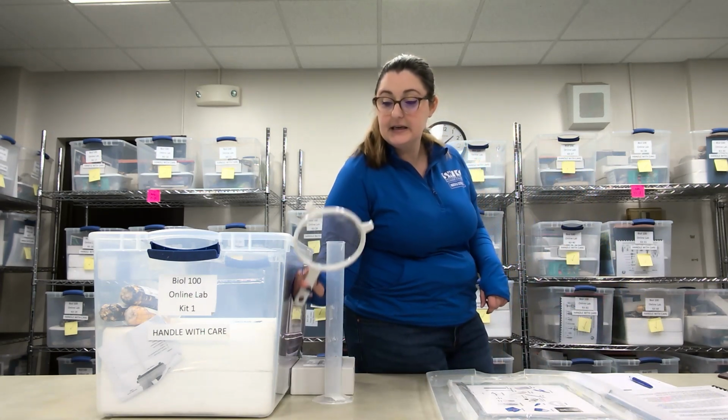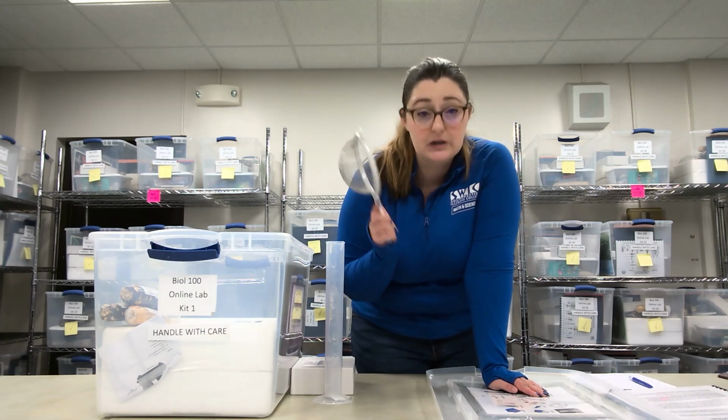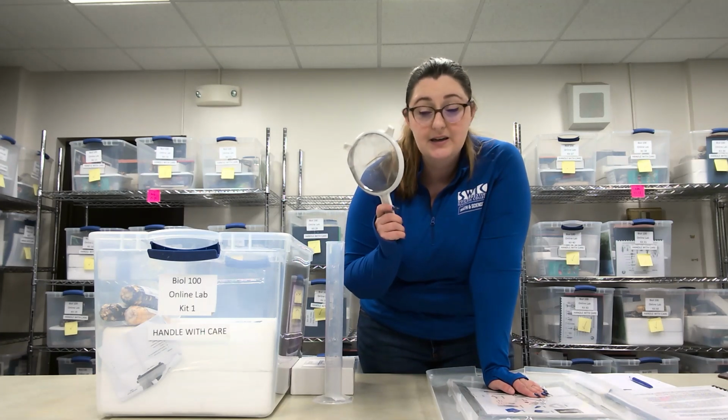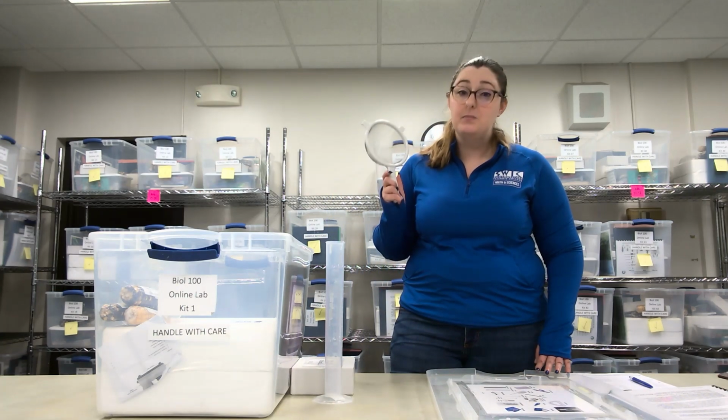Next is the mesh strainer, this guy. Please make sure to clean this very well when you have finished using it. They are a little bit hard to clean. Do your best, but please clean it.